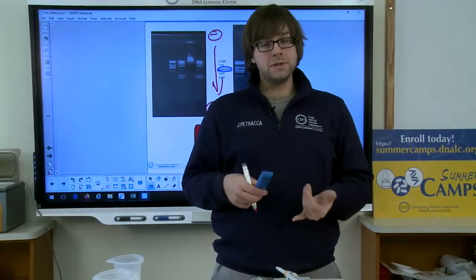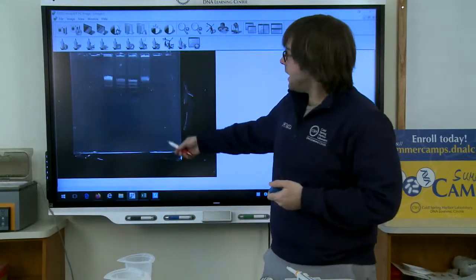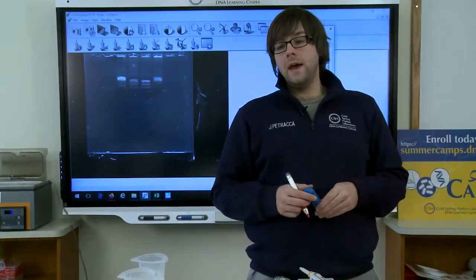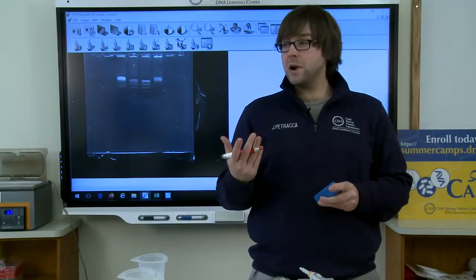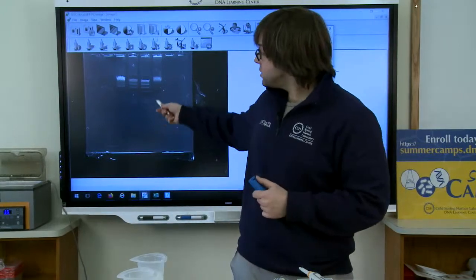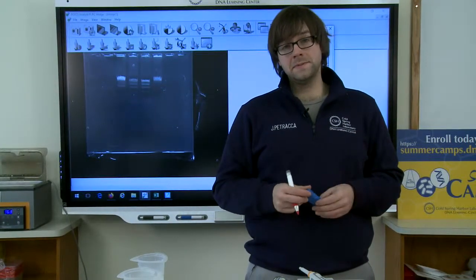All right, so hopefully you guys had fun today. We did answer our question. So remember that mystery enzyme wound up being Hind just because it had a similar cut pattern to the Hind control. And if we were to repeat this experiment using a different mystery enzyme, we should be able to figure that out as well, just by matching it to our Eco and our Hind cut patterns.